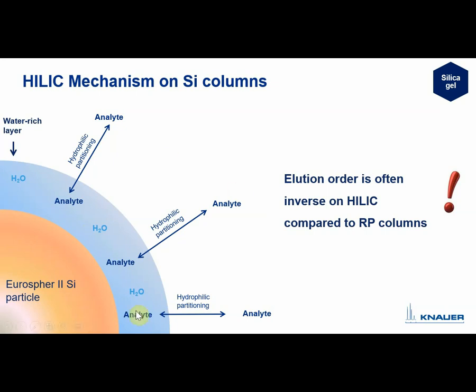And if you have your water-rich layer on the particle, you have the hydrophilic partitioning of your analyte. So it's really not interacting with the particle, but with a hydrophilic layer here. So this is what the analytes do if you have a typical HILIC mechanism on bare silica gel columns. And you can imagine there are molecules that can be separated in HILIC and also maybe in reversed phase mode.